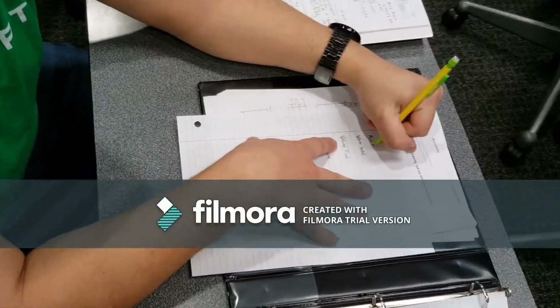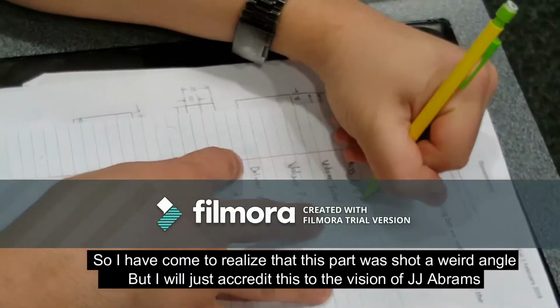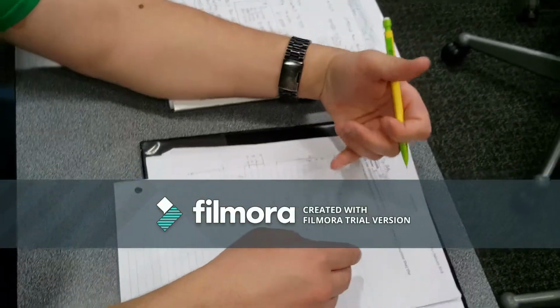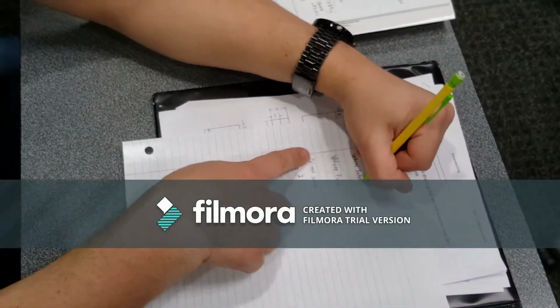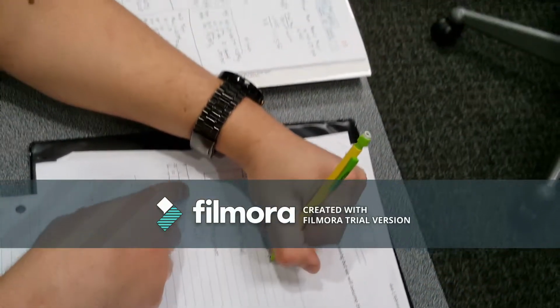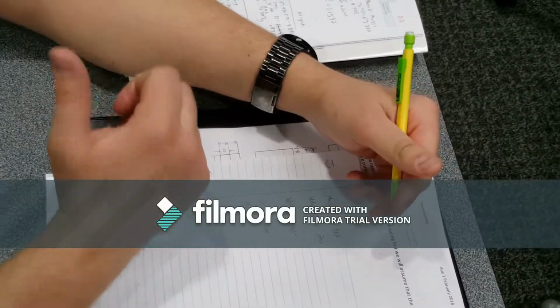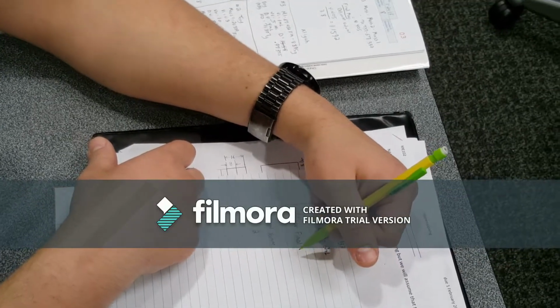The mass 1 was measured. This was the beaker without anything in it, just the beaker itself, which we don't need right away. We got that and wrote it down, put it to the side. And then the volume initial, which is what we put into the pipette as far as water goes, came to be 2 milliliters. And the volume final was after we took the pipette and put it into the cylinder.